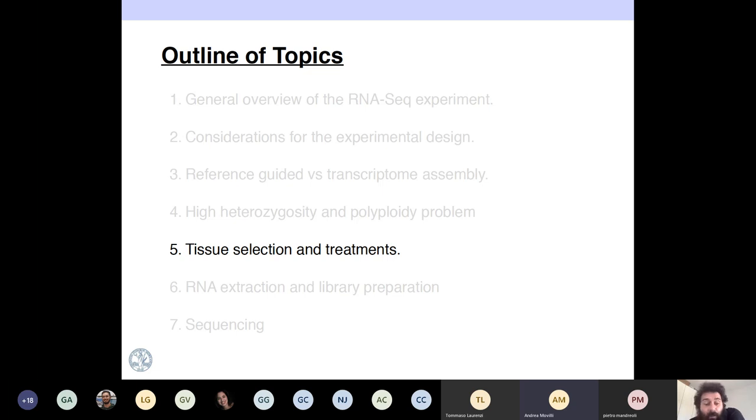Yeah, indeed you can. One solution is to use long reads from Oxford Nanopore. That will fix some part of the problem, but these reads have a lot of errors. Sometimes the amount of errors inside the read is higher than the variation between the copies, and then you still have that limitation for the mapping.